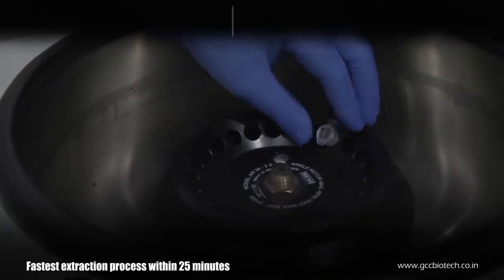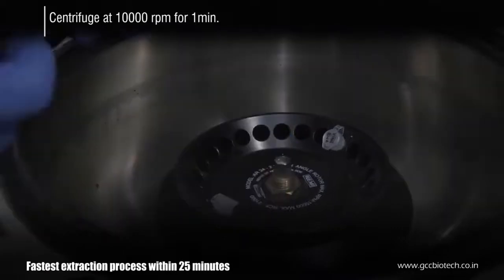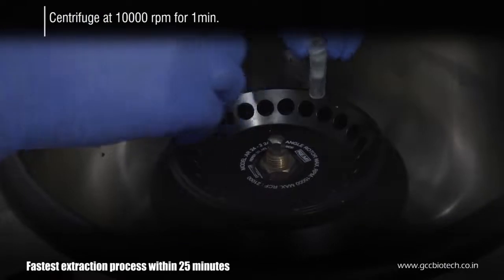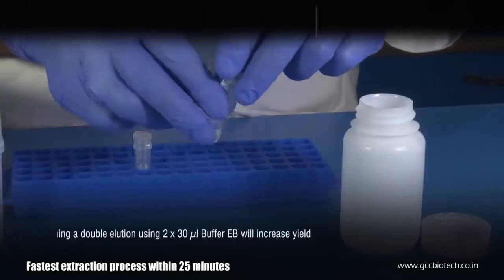Load the mixture onto the column and centrifuge at 10,000 rpm for 1 minute. Discard the flow-through.